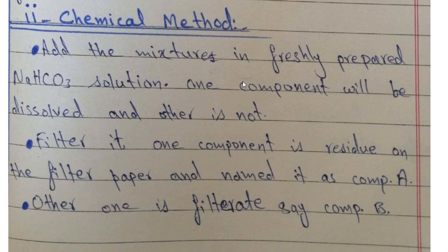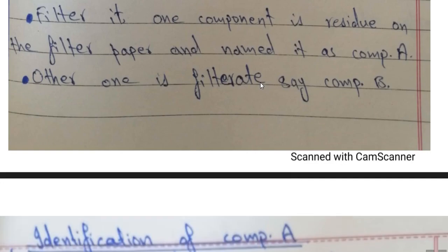The residue on the filter paper will be dried and become Component A. The other component passes through as filtrate. For the filtrate, we acidify it by adding dilute HCl in a minute amount until precipitates form. When precipitates appear, we filter them out. These precipitates will be called Component B, and Component B is thus separated out.